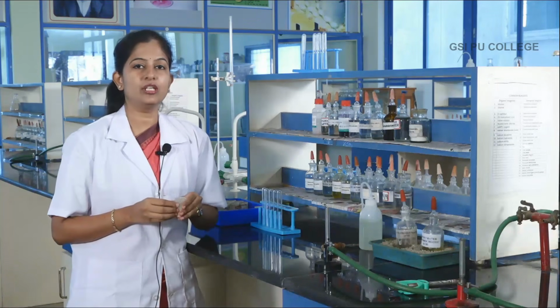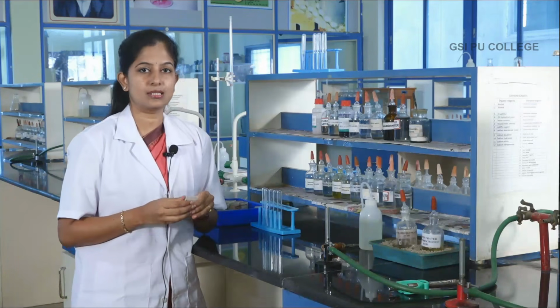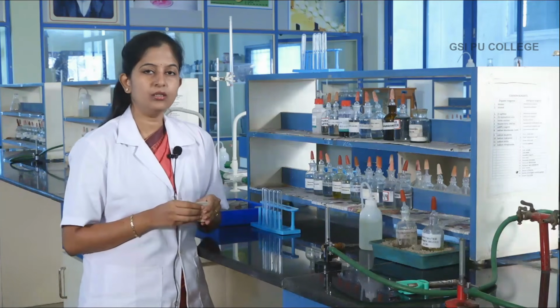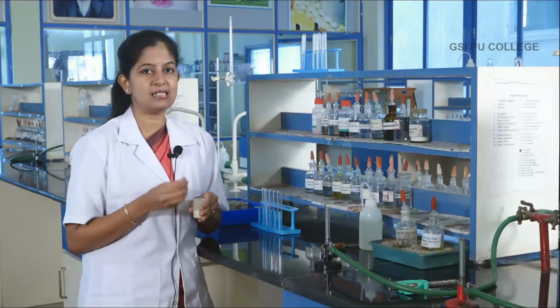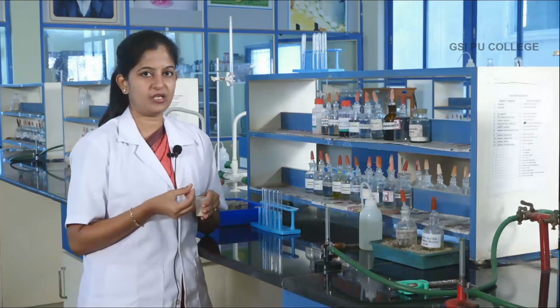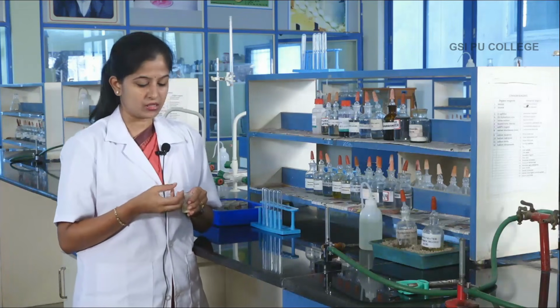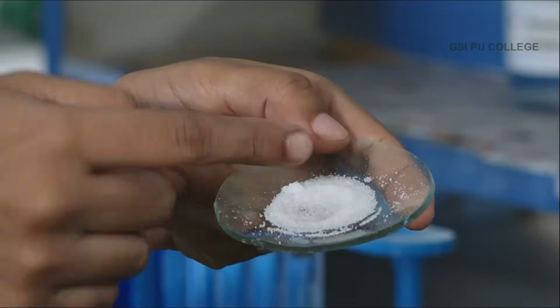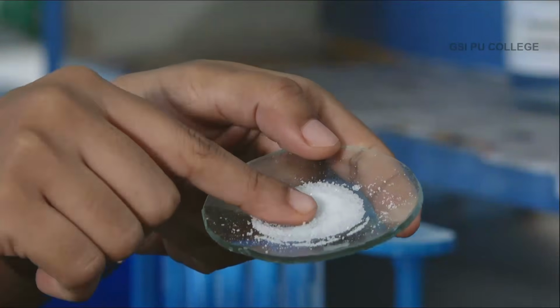First you have to look into the physical state of the given salt, whether it is amorphous or crystalline. When you touch the salt, if you have a feel of talcum powder, it is amorphous in nature. If you feel crystal-like substances with your fingers, it is called a crystalline substance. If you observe this salt, it is crystalline, since you can feel crystal-like substance. Hence the salt is crystalline in nature. The color of the given salt is white.